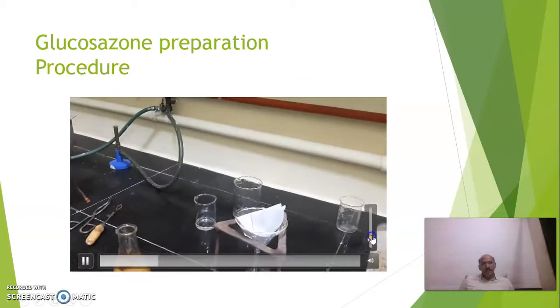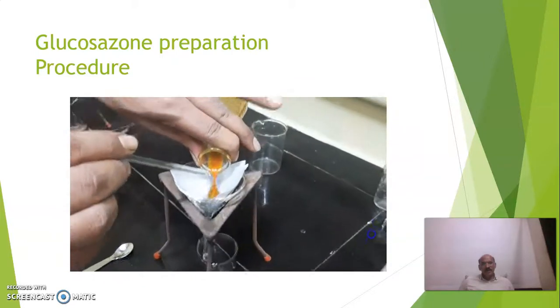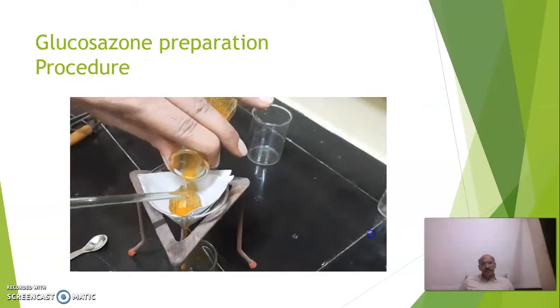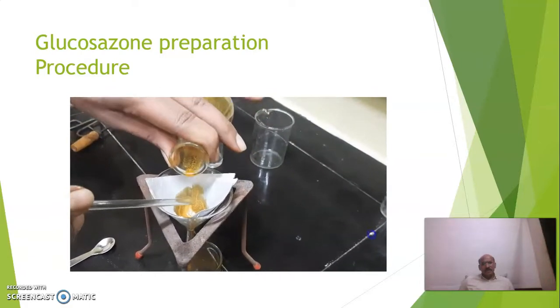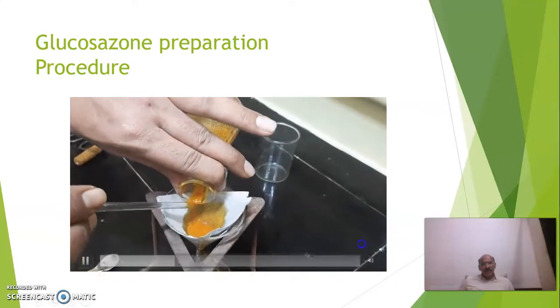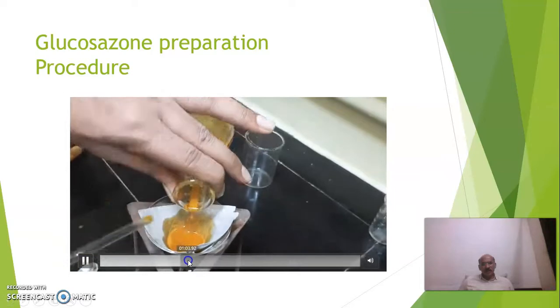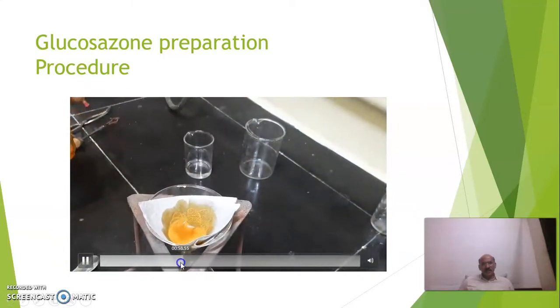After cooling, we have to filter it. After crystallization, it will be clear yellow. Now little brownish shade is there.